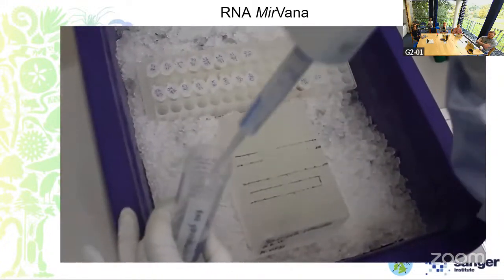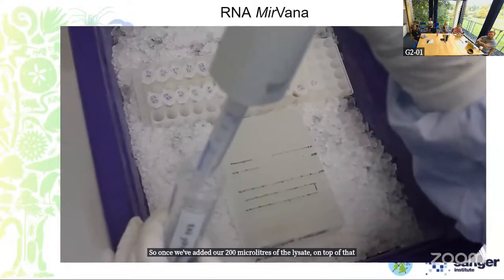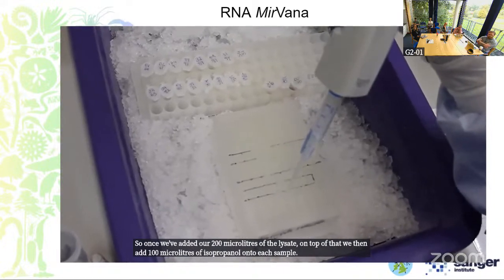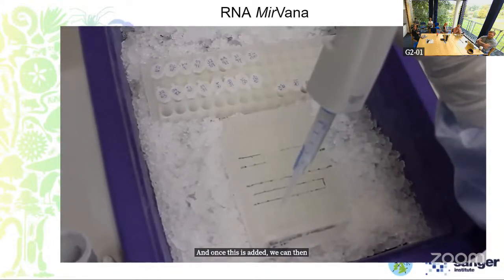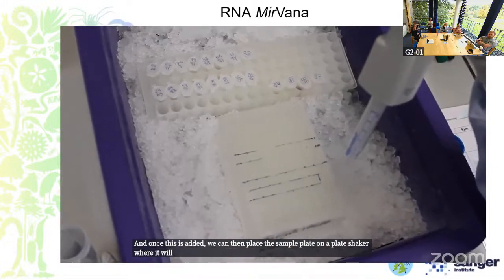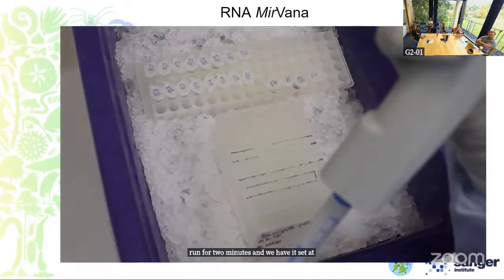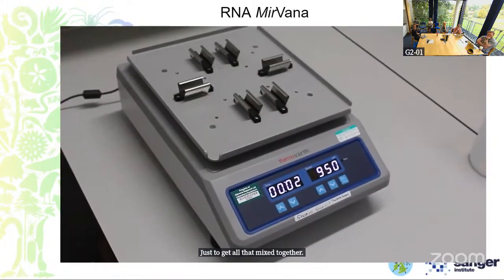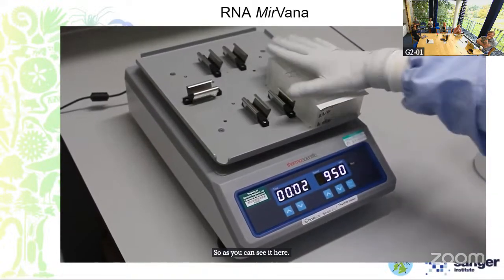So once we've added our 200 microliters of the lysate, on top of that, we then add 100 microliters of isopropanol onto each sample. And once this is added, we can then place the sample plate on a plate shaker where it will run for 2 minutes, and we have it set at 950 RPM just to get all that mixed together. So there, as you can see it here, and remember to seal your plate.